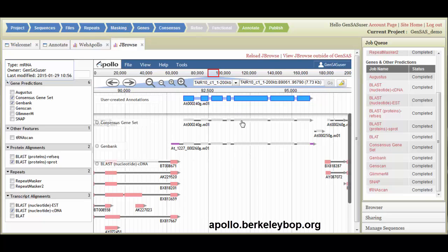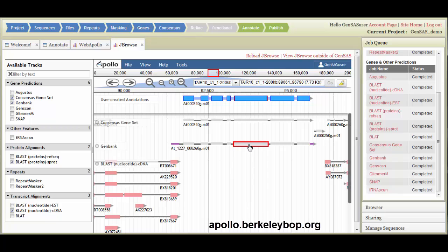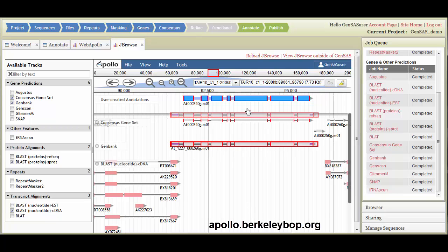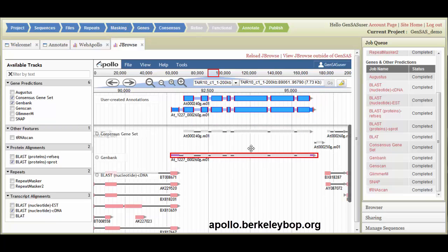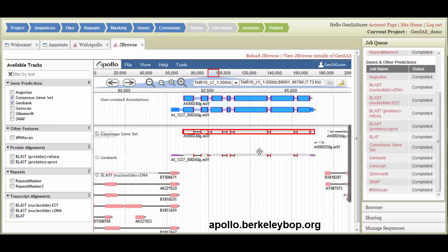WebApollo lets you do many things, and I'm only going to give you a brief introduction. First off, the user-created annotation track is fully editable, and any of the features from below can be dragged onto the user-created annotation track. To drag a feature, you simply need to select it and drag. Please note that if you only select an intron or exon and try to drag, only that region will be taken to the user-created annotation track. You need to double-click to select the whole gene model.